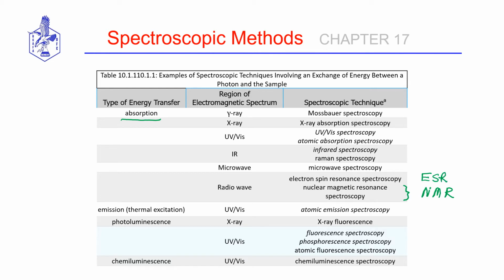and microwave spectroscopy. If we get up into the infrared and measure absorption, okay, we are looking at perturbation of the rotational states of molecules and polyatomic ions and the vibrational levels. This forms the basis of Fourier transform infrared spectroscopy, in which we get structural information about molecules and polyatomic ions.